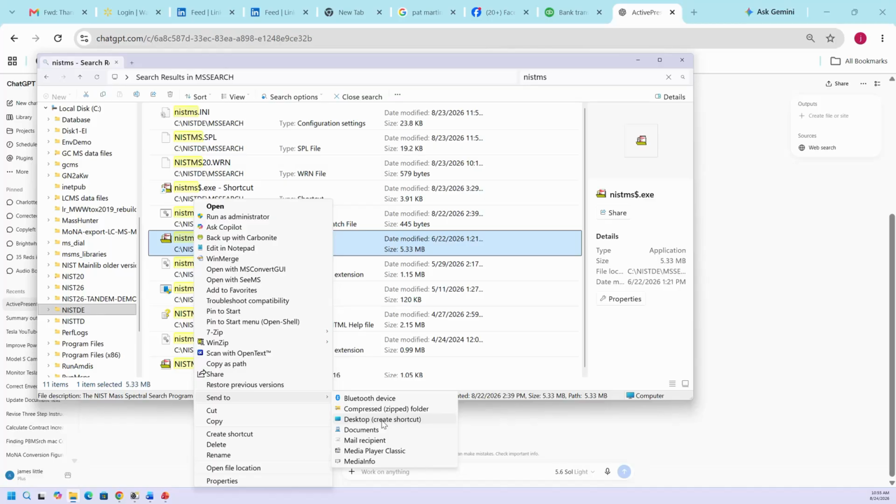And then I had a way to access it on my desktop. Usually the program opens within the Agilent software, but you might want to go in there directly at times. So put yourself a shortcut somewhere that you can find. So those are all the basic types of changes, but they're discussed in detail in the handout.